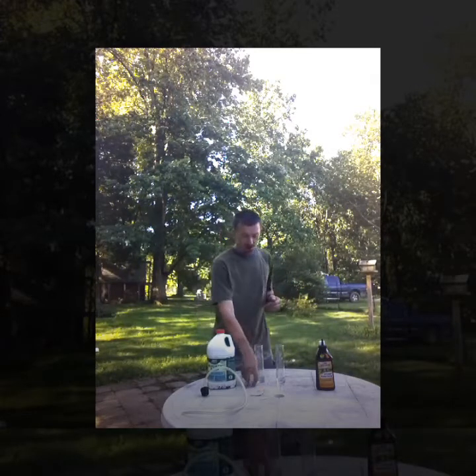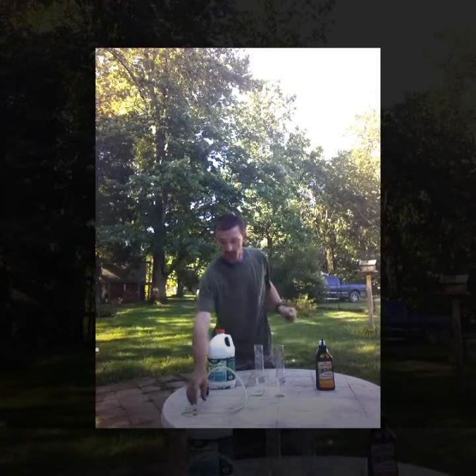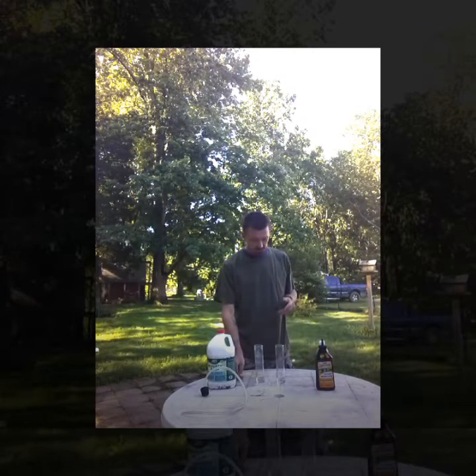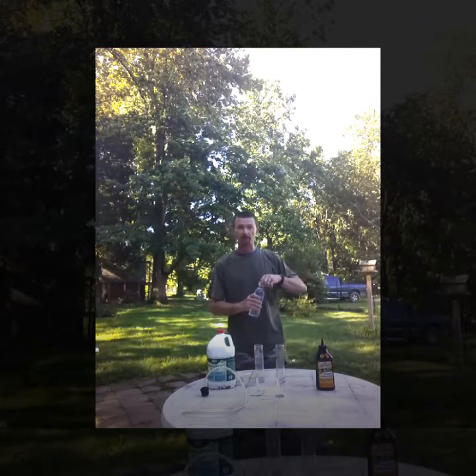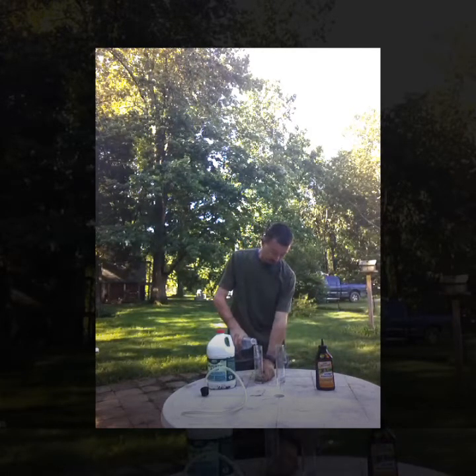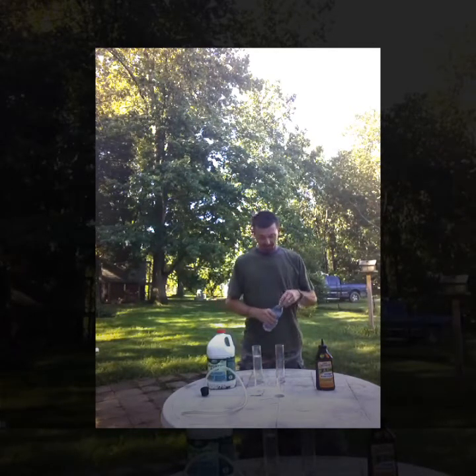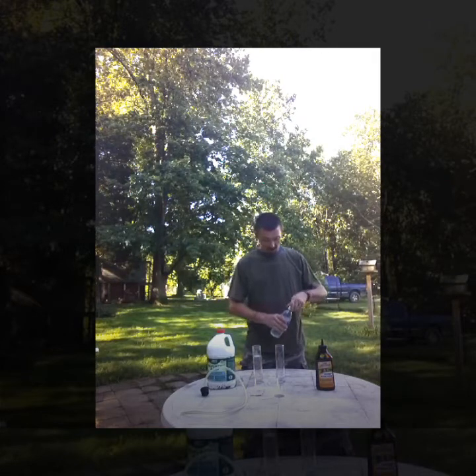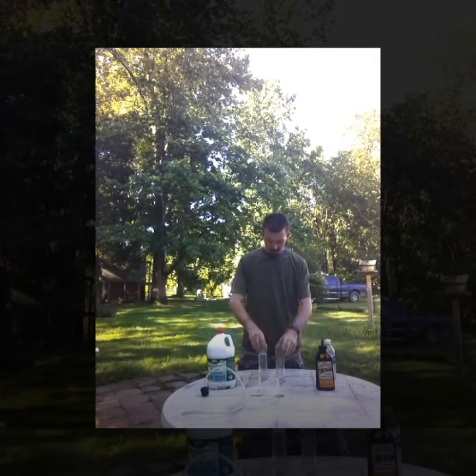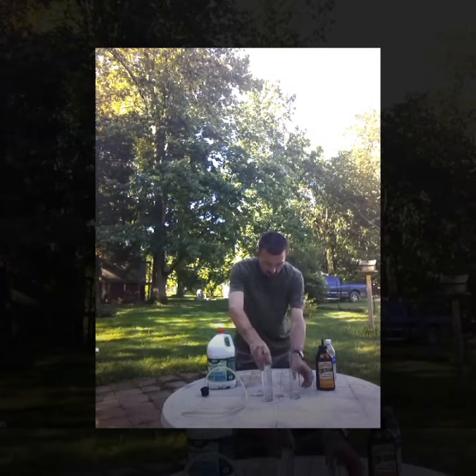You're also going to need a piece of copper — I just cut a small piece off a spool of wire. What you're going to do first is take some of your distilled water and pour it into what's called a thumper. We're going to fill it right around half to three quarters.